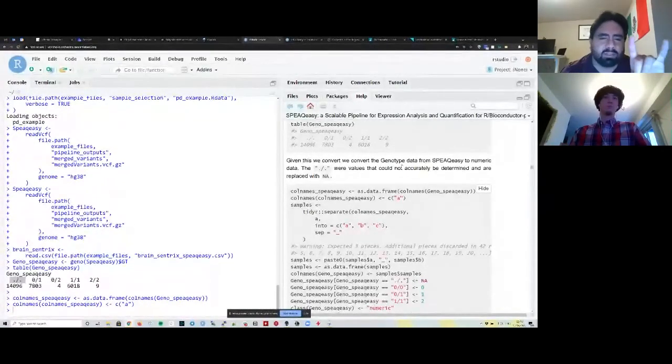So let's say you have a single read that overlaps your variant, and maybe that read tells you that instead of the more common genotype, let's say A, you have a T. You might not believe that because it's a single read, but if you have, let's say, 5 or 10 reads, then you might start to believe it.